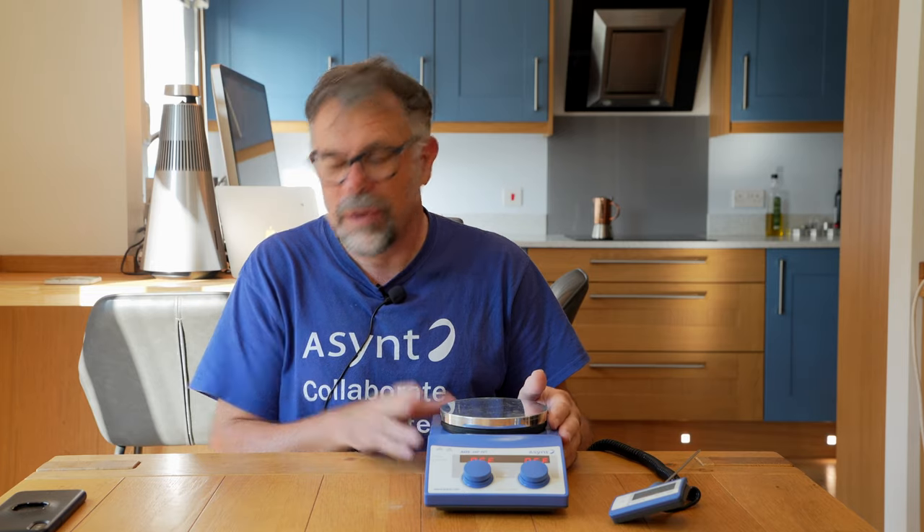Welcome to Asynt. My name's Martin Fordham and today I'd like to show you how with a standard magnetic stirring hot plate you can heat and mix the contents of a five litre round bottom flask.